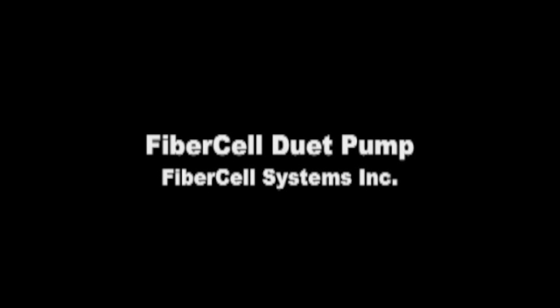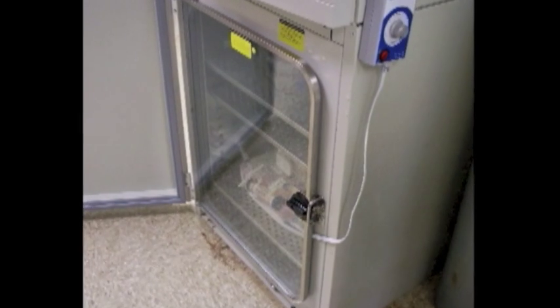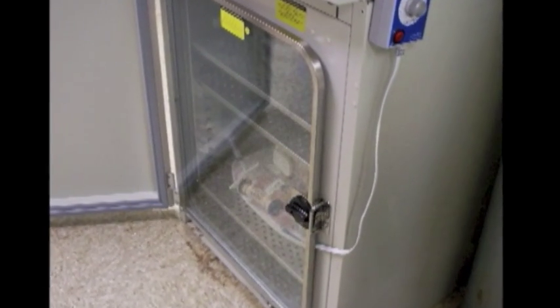The FiberCell Duet Pump will support one or two hollow fiber bioreactor cartridges. It is designed to fit inside of a standard CO2 incubator, and it is the incubator that provides gas control and temperature control.